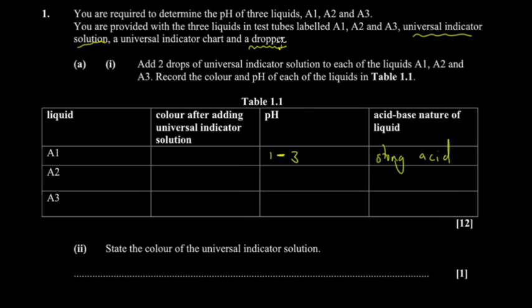And then also, if you're going to drop the solution, drop equal amounts of the universal indicator solution.